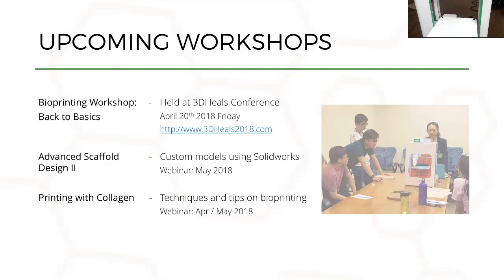And as I mentioned, we would also be demonstrating printing with collagen, which is the fresh printing method, for those of you who are interested, and we'll definitely share some tips and techniques on using the fresh printing method.